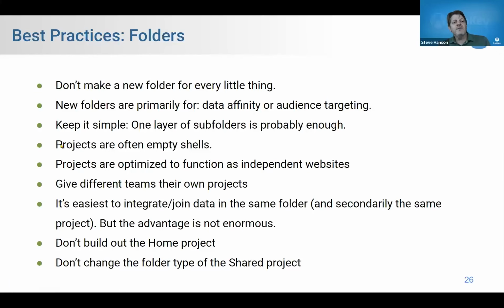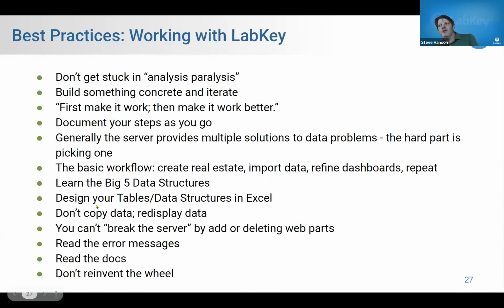Often projects are like empty shells. They don't really contain a lot except for security configuration and data shapes, like table definitions, things like that, and all the real action is happening down in the subfolders. There's a lot more here, but I'm just going to keep going. And also some basic best practices for working with LabKey.